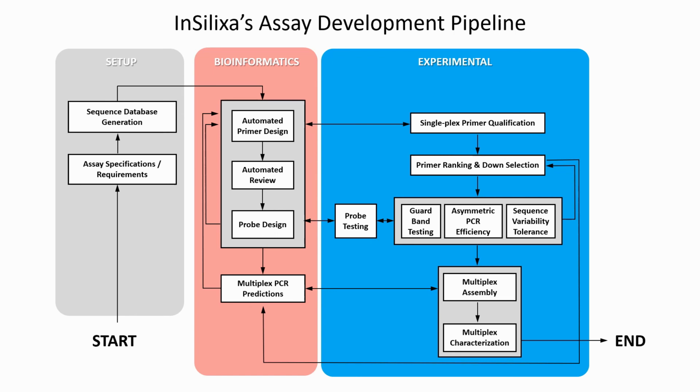That can be cumbersome. There's a lot of repeated sequences. There's a lot of issues with what you download from NCBI and all of them.